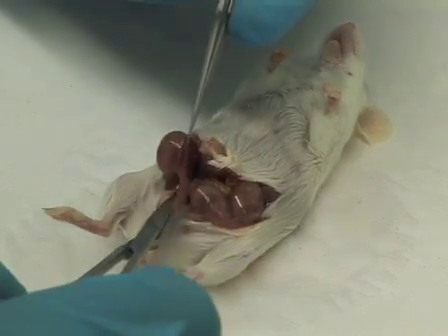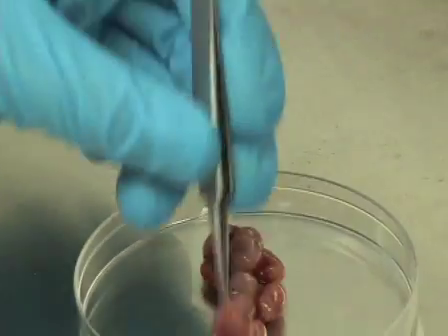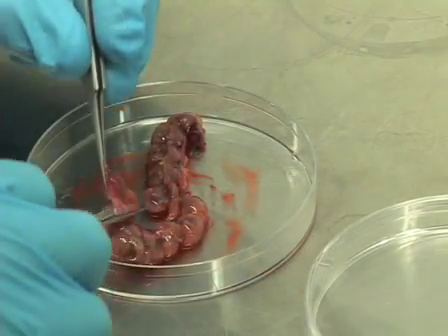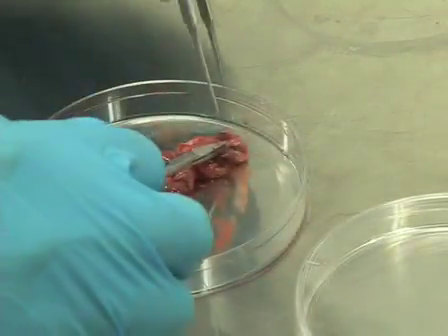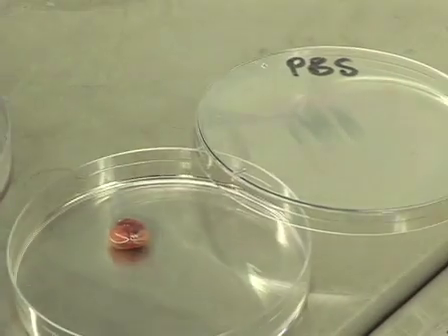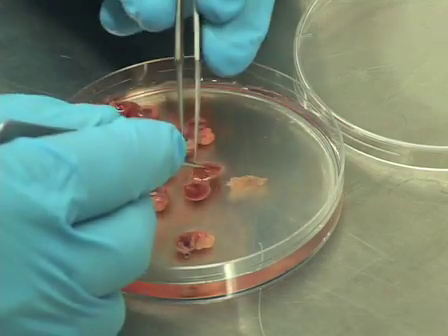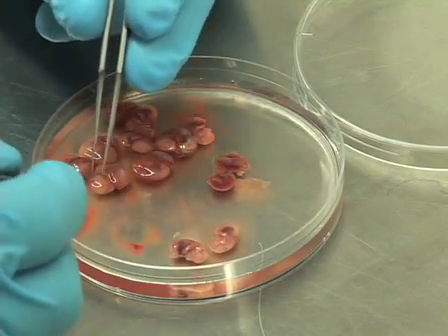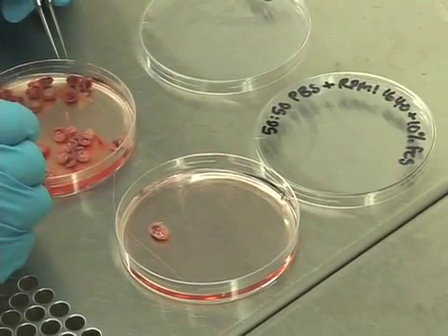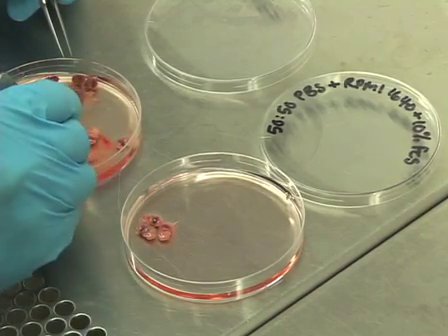Remove the uterine horn and place it into a sterile 10cm petri dish. Cut along the length of the uterine wall and remove the embryos still in their amniotic sacs. Wash them in a petri dish containing 10mM PBS. Using two pairs of fine forceps, carefully tear open the amniotic sac and free the embryo from the sac and placenta. Next, transfer the embryos to a fresh petri dish containing a 50-50 mixture of PBS with RPMI 1640 media with 10% FCS.